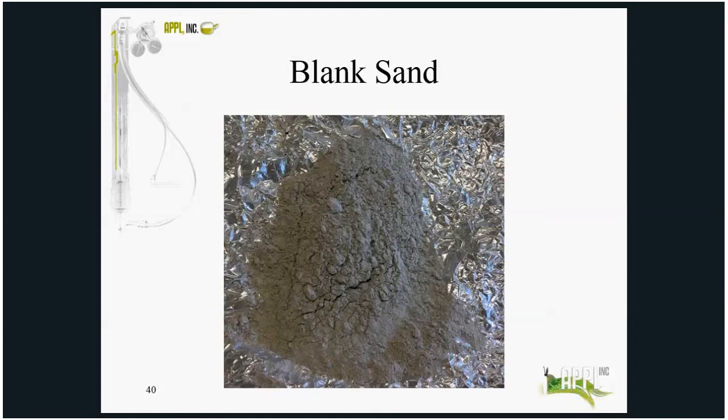After each sample, we grind a sand blank. We'll grind the sample, we'll wash the bowl, we'll dry it thoroughly, and then we'll grind blank sand. We'll do this after every sample. Once the sand is ground, we'll put the next sample in and grind it. And we'll do this for each bowl after each sample. This way we check for cross-contamination. I do have to say though, we've never seen cross-contamination in the bowls. The cleaning process is pretty thorough, and we've had samples that contained up to 2% of TNT with no cross-contamination.